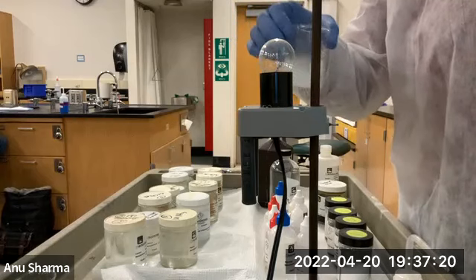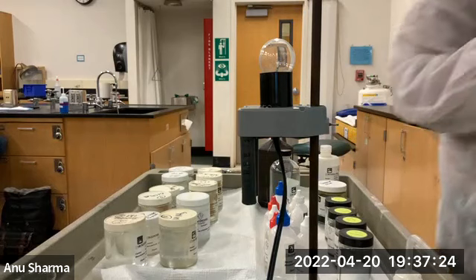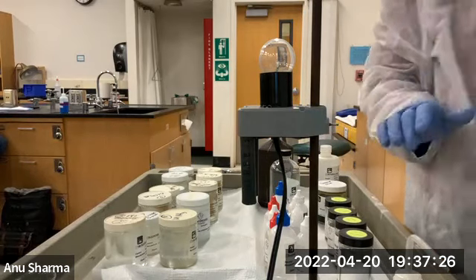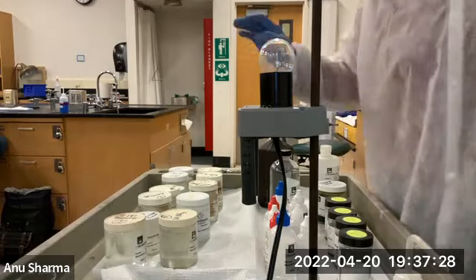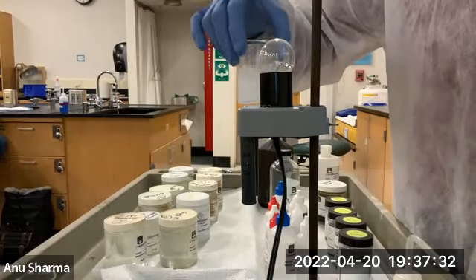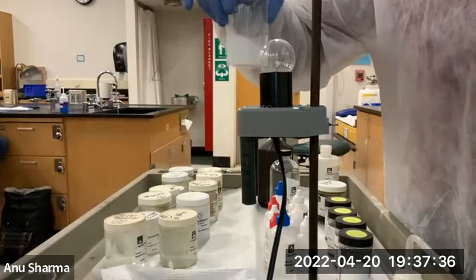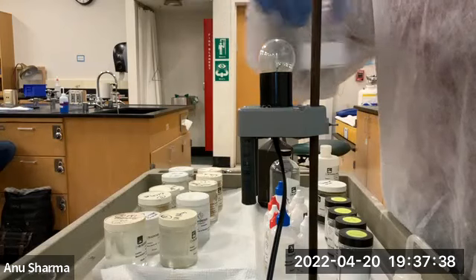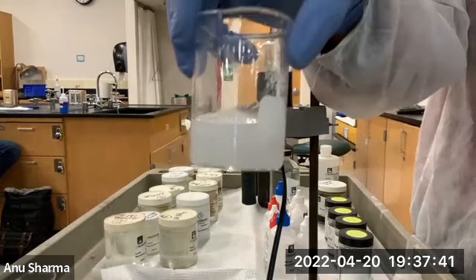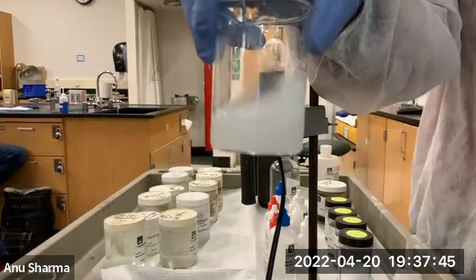When all of the H2SO4 is consumed, when all of the barium hydroxide is used, then the reaction would be complete. One of the components has to be a limiting reactant. But anyways, the turbidity tells us this is barium sulfate, and this barium sulfate is insoluble in water. That's why it's crashing out.